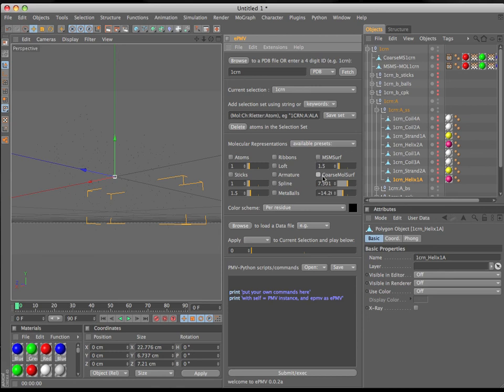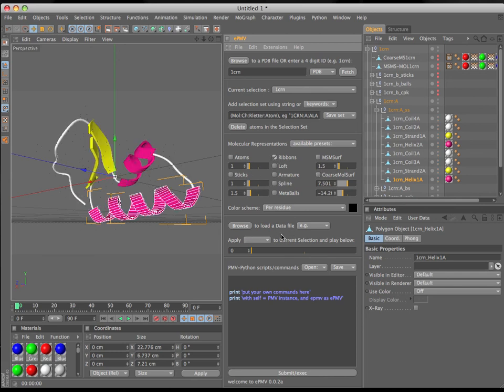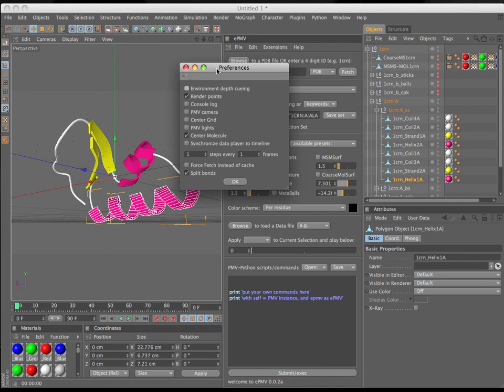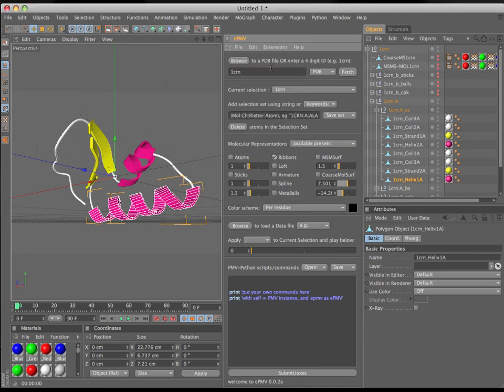I think that's good for a basic introduction. On the next movie, depending on which movie you click on, I'll show you how to load other types of data files, or how to make more sophisticated selections. Eventually we'll get into some of these really interesting extensions and other options available from within the graphic user interface of EPMV itself. Talk to you soon.